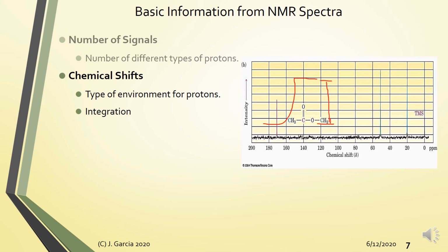Do you have a CH3 type of hydrogen, so methyl group ba yan? Is it a methylene group, so CH2, or is it a methine group, so yung CH?